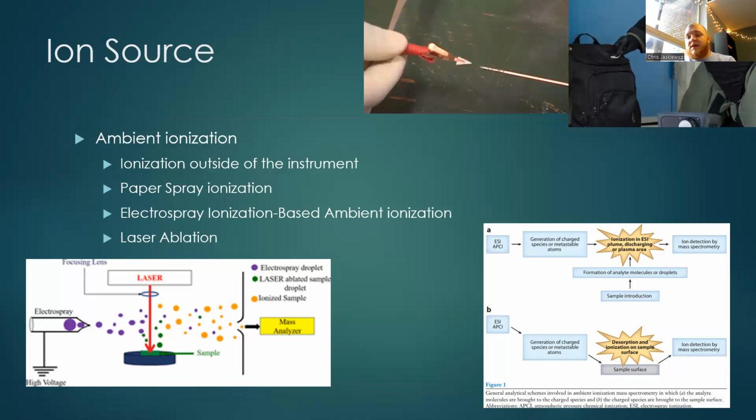So one thing I'm going to immediately pull out. So one of the main issues that the scientific community ran into when we're talking about the field applicability of mass spec, right, is ionization. Just a factor of mass spec, we need to somehow get these chemicals, these substances into an ionized form for them to then be manipulated by an electric field and be detected using our mass spec, right?